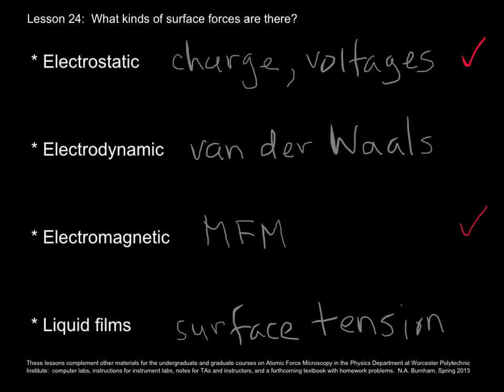I will talk about van der Waals forces and liquid films, however, because those are the two most common types of forces that you're likely to encounter. Now, given the amount of time left in this lesson, I'll do the shorter of the two topics, and that is that of liquid films.